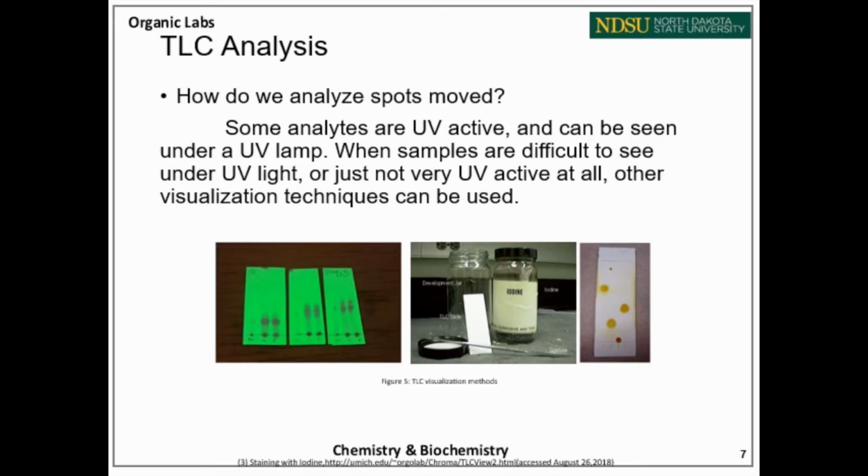So once you remove your slide from the TLC chamber, you want to let it dry. After that, you'll probably be a bit confused because you probably won't see anything. Well, that's because some compounds are UV active and can only be seen under a UV lamp. Once you take your slide to the UV lamp in the back of the room, you will be able to see your mixture separating on the TLC slide, which will look a little bit like the image on the far left.